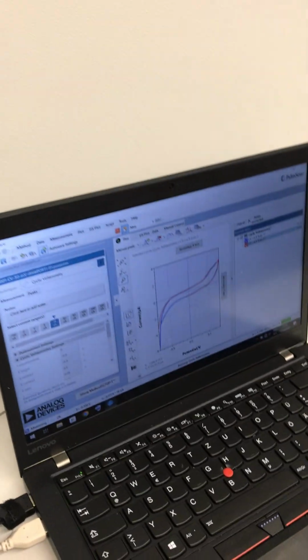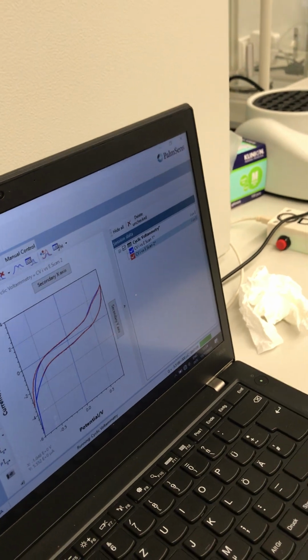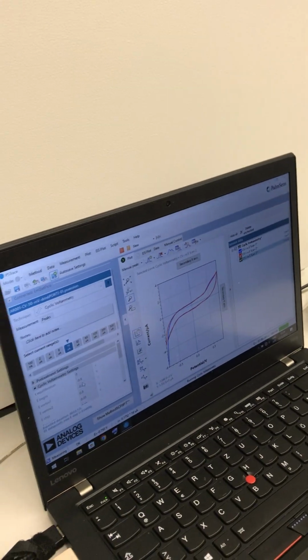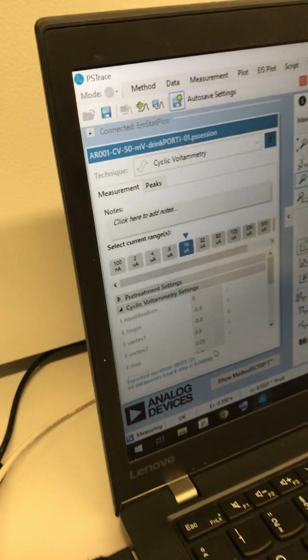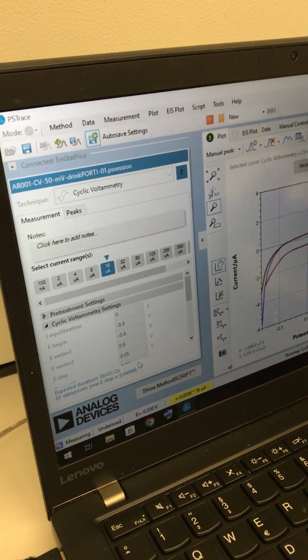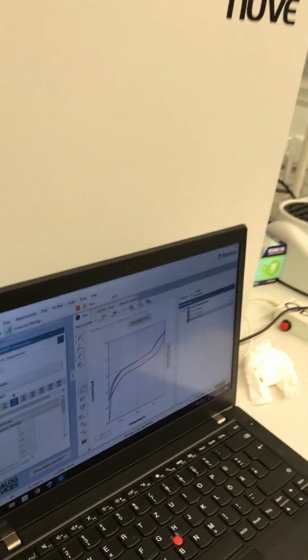So the labels are here. But actually here you are maintaining the red and blue and green, right? Yeah, these are 3 cycles, and maybe I didn't talk much just now, concentrating on oxidation. We apply the voltage from negative 0.8 to plus 0.8, and we repeat it 3 times. The reason why I repeat is that we want to see what's happening in the second and third cycle, to say that the system is stable. Okay, it's basically repeated.